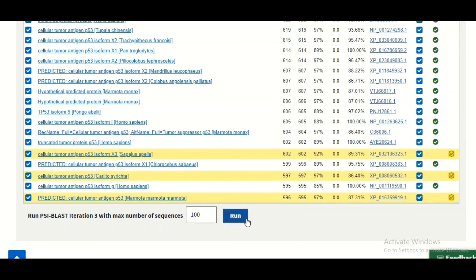Now in that third round, maybe some new sequences appear in front of you, but if in the third round no more new sequences will appear in the search result, it means that all of the true positive values are selected.